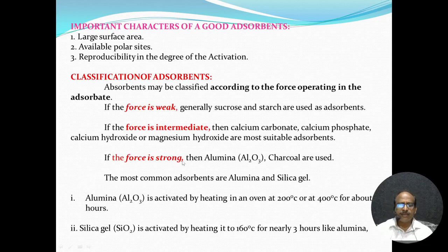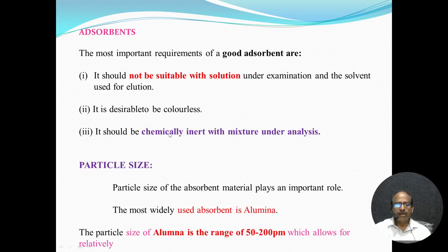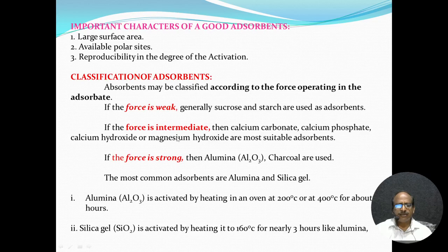Now, we have already mentioned the classification of the adsorbent. Classification of force according to the force operating in the adsorbate. Whenever we use the adsorbate, the force applied may be fast, slow, whatever it may be. If the applied force is very weak, generally we use adsorbents like starch and sucrose. Sucrose is used for the weak force.